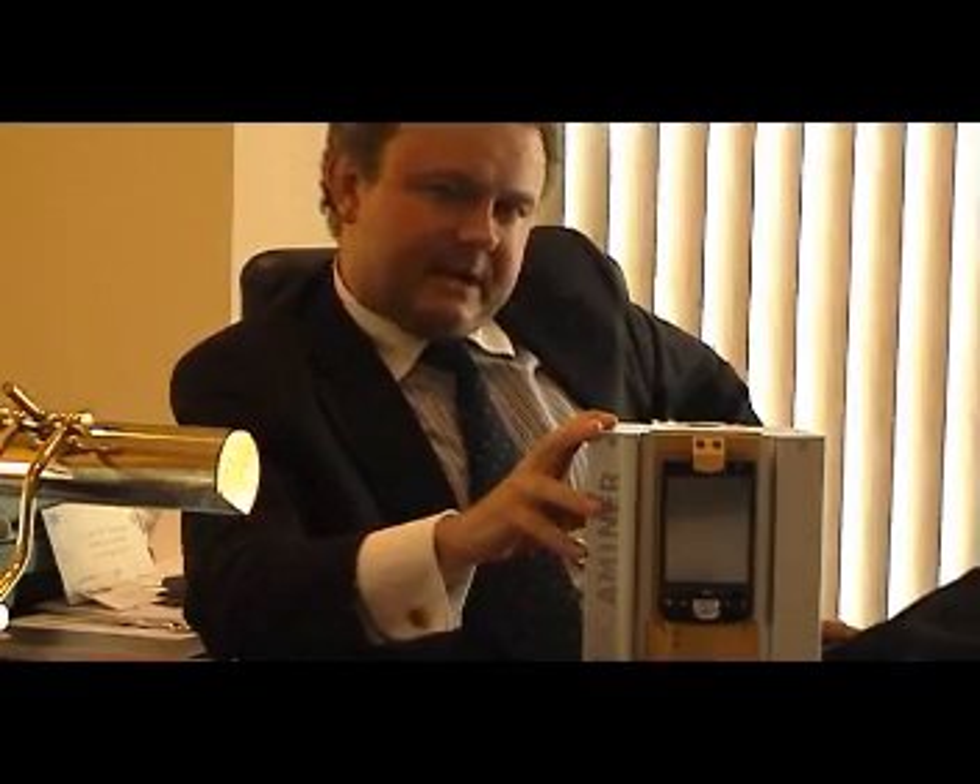Hi, I'm David Laurier. I'm the president of Applitech out of Belgium and I'm very happy to be with you today. I have the honor to share with you the first benchtop and portable EDXRF analyzer in the world.